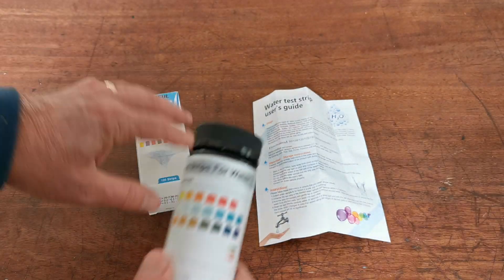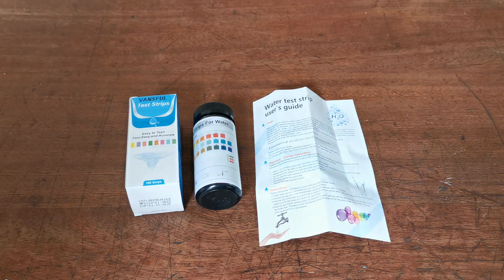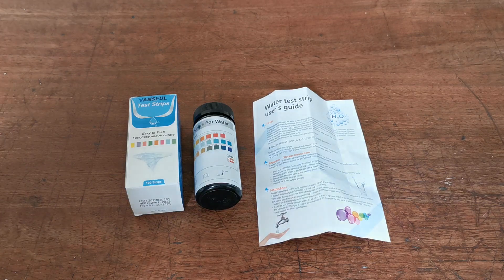Once that seal is broken, although there will be a pouch of desiccant — a moisture-absorbing chemical — in each vial, it is critical that you keep the test strips dry. Open the vial, remove a test strip, close the lid, and then go and do your test. Don't try to do your test with wet hands or a wet test strip and leave the lid off, because the more moisture that gets into the pack, the quicker the test strips may deteriorate.